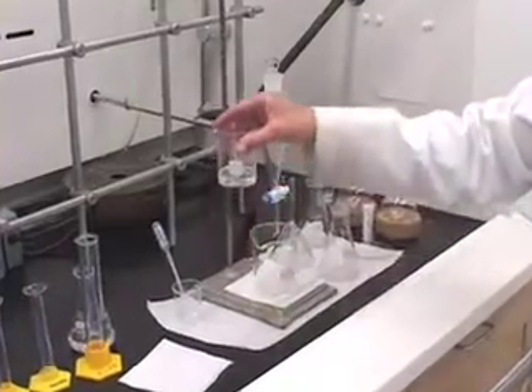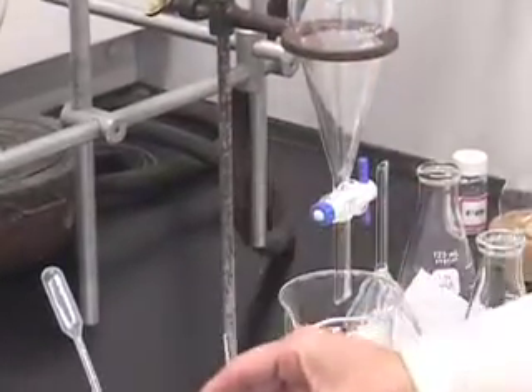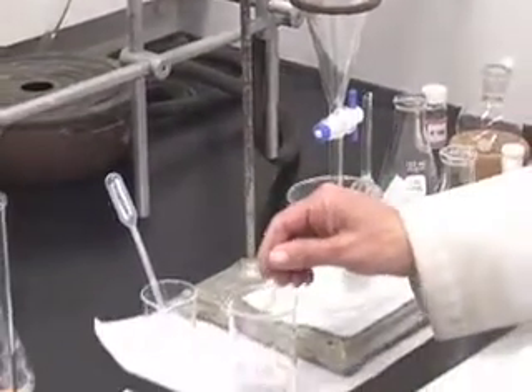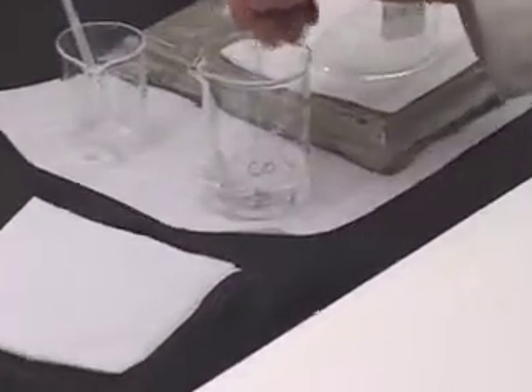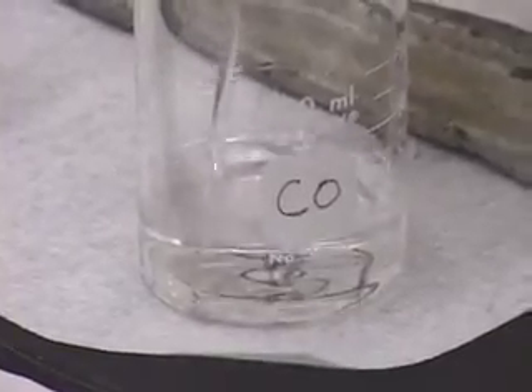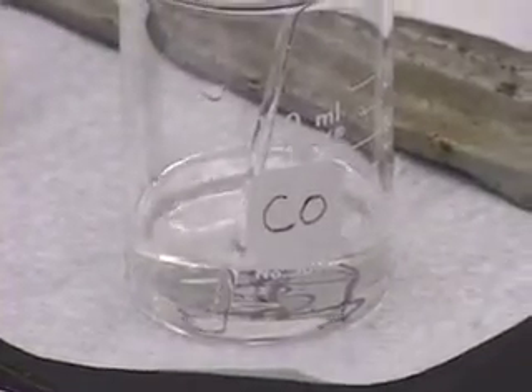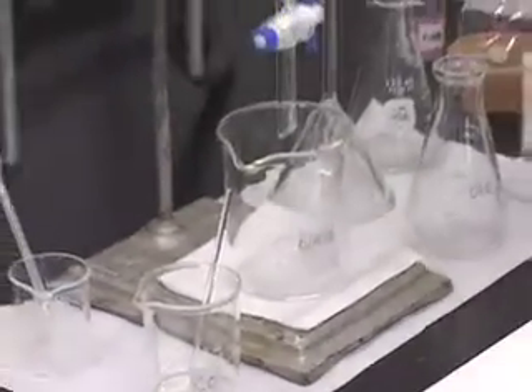Pretty much all of the compound has dissolved except for a few crystals, so I'll stir it a little bit longer. It's all dissolved now. We are going to transfer this solution to the separatory funnel.